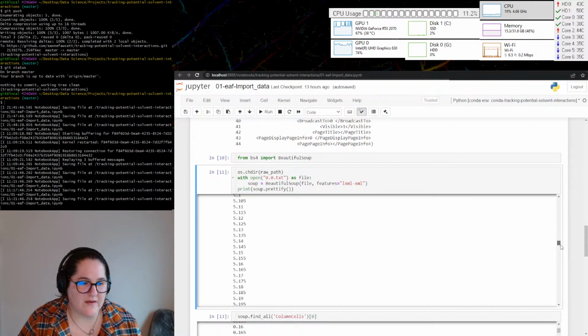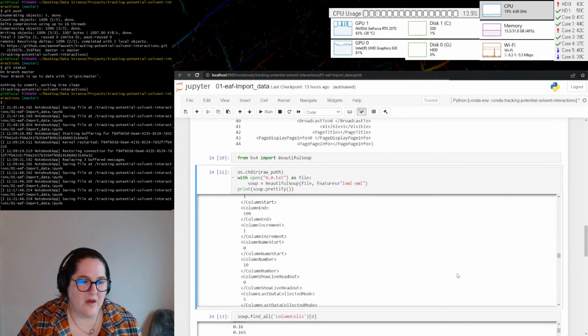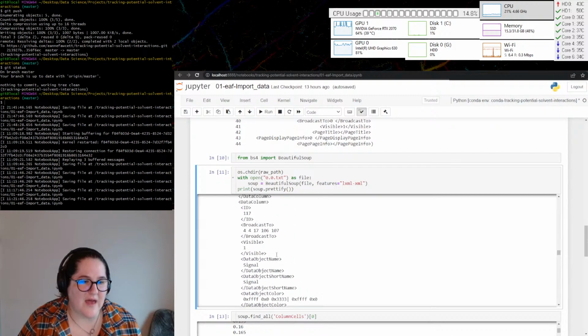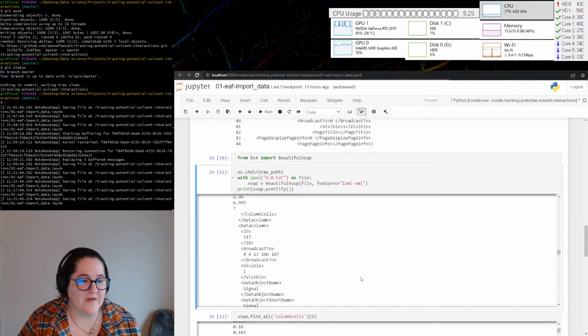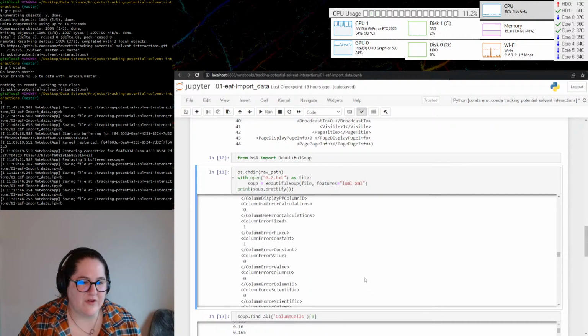this was kind of like a 7-minute run. You can see it ends there at 7, so that tells me 7 minutes passed by. Then we have some more information. So we now know, because these are separated by columns, all of these tags are column specific, which is kind of interesting to me. And so there might be some additional information in there that we could get about the columns.